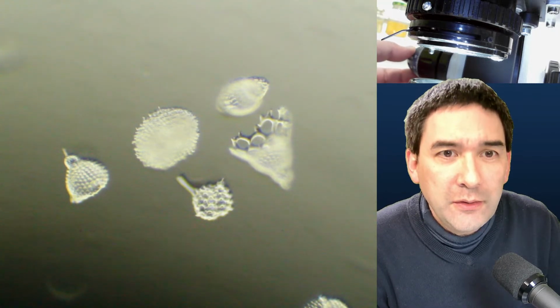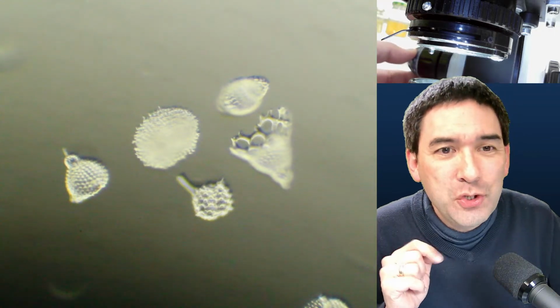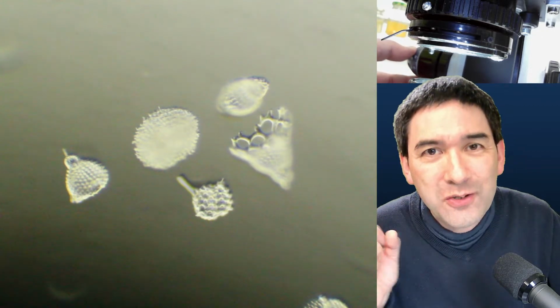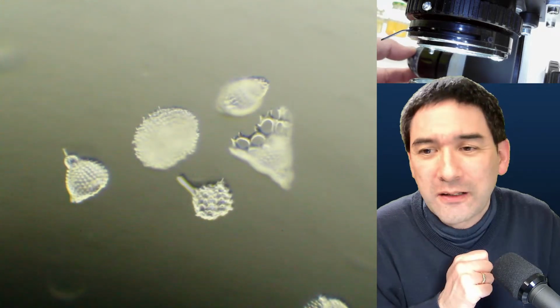I have to tell you that it looks way better if you look through it under the microscope directly. But currently the image is not quite as clear and as crisp. The reason is that the camera resolution, which is sent out over USB, is not quite as high. So it's not full HD that I have. It's a fairly old camera, so it does look better if you look directly through it. Okay.